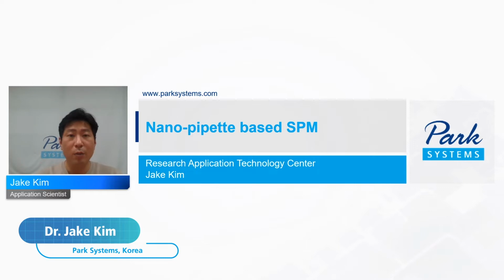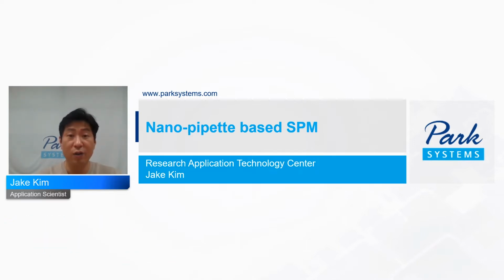Today I'm going to talk about nanopipettes and the scanning probe microscope techniques using that nanopipette. Well, generally the scanning probe microscope, we can call the SPM, utilizes a very tiny and rigid tip for monitoring sample surface. But we can also use a nanopipette as a probe for exploring a sample's morphology and its properties. Okay, let's look into what a nanopipette is and how we can utilize it for monitoring the nanoworld.